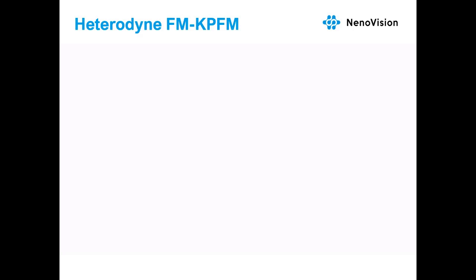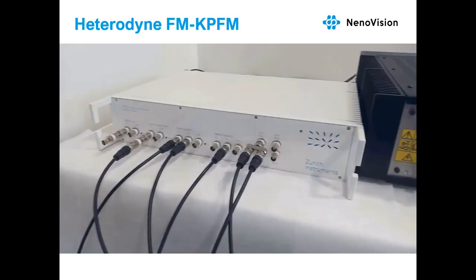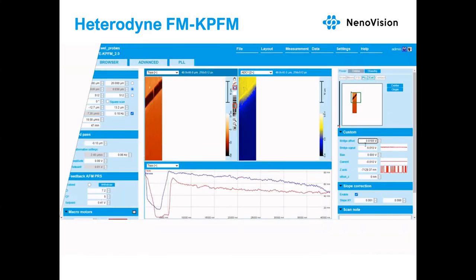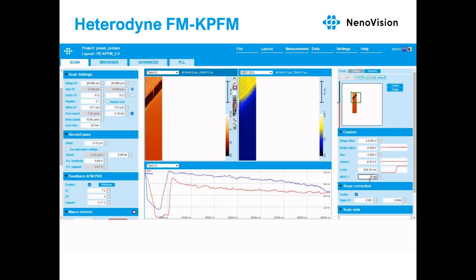The next method is the heterodyne FM-KPFM — Kelvin probe force microscopy — which is a little more complicated to set up. To measure this technique we use an external lock-in amplifier connected to LightScope via the board at the back. To save time we skipped the auto-approach procedure, so enabling the feedback brings the probe right into contact. To move away from the sample, we disable the feedback and increase the offset so the probe is lifted above the surface.